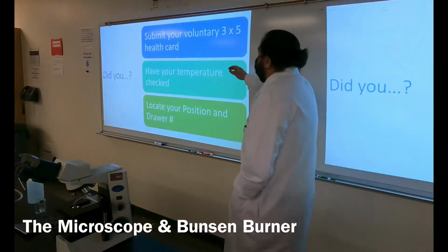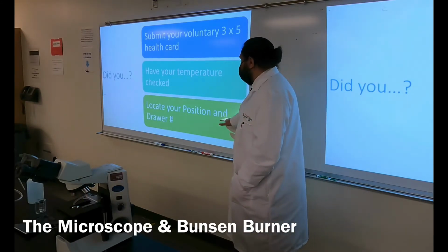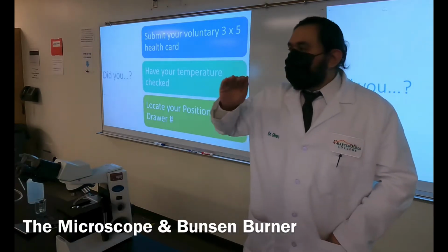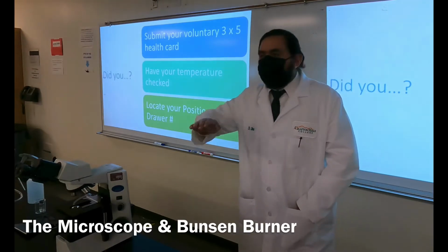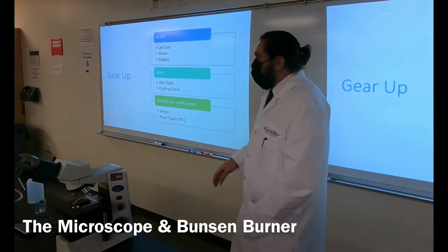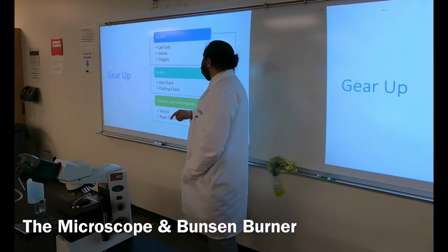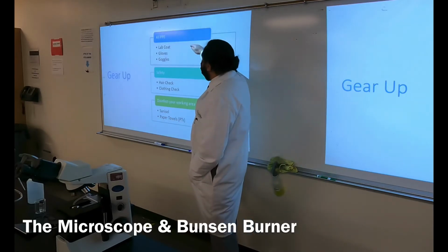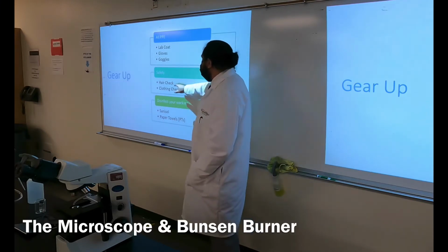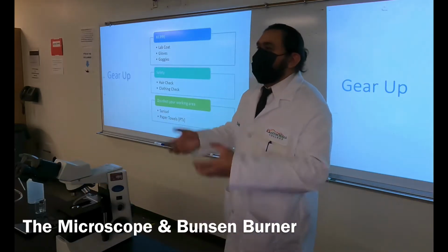Now, first step, like I said, our information of our health. We do our temp check, and then make sure you all found your positions, which you've already done. Well done. Depending on which session you're in, you might be the top row, second row, third row, or fourth row. Then we want to gear up. That means you want to put on all your PPE, which includes your masks. Those are still mandatory for us on campus, regardless of the state. Your coat, your gloves, and your goggles. Those are the key ones for right now. Normally our lab technician will always walk in and double check that you're not wearing open-toed shoes or that your hair is down, that kind of thing.